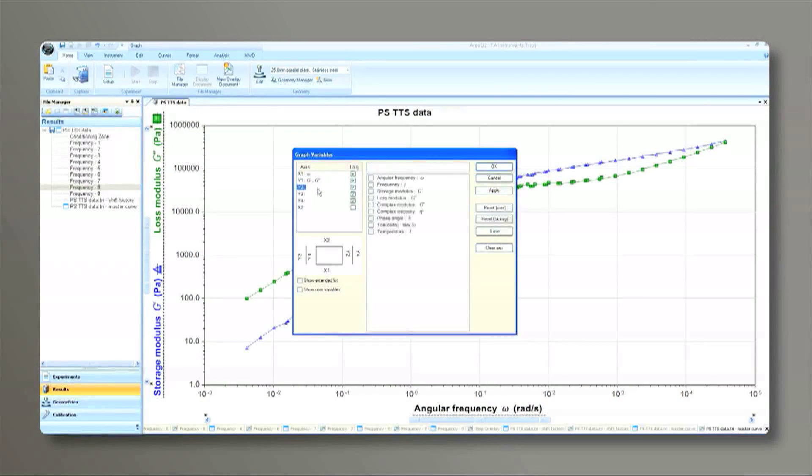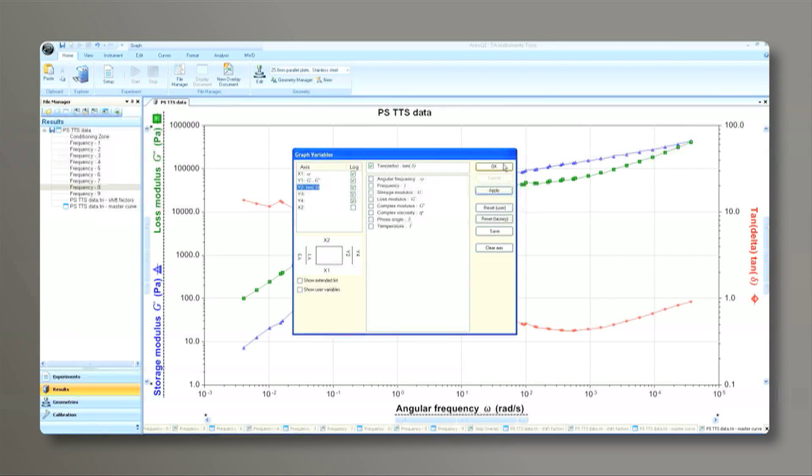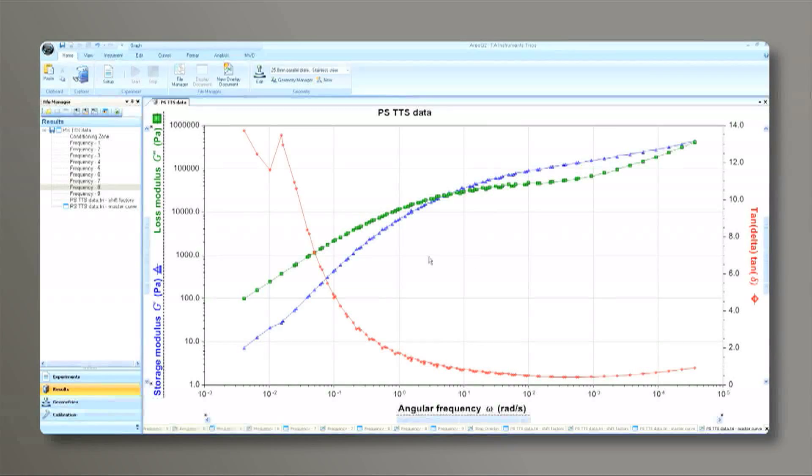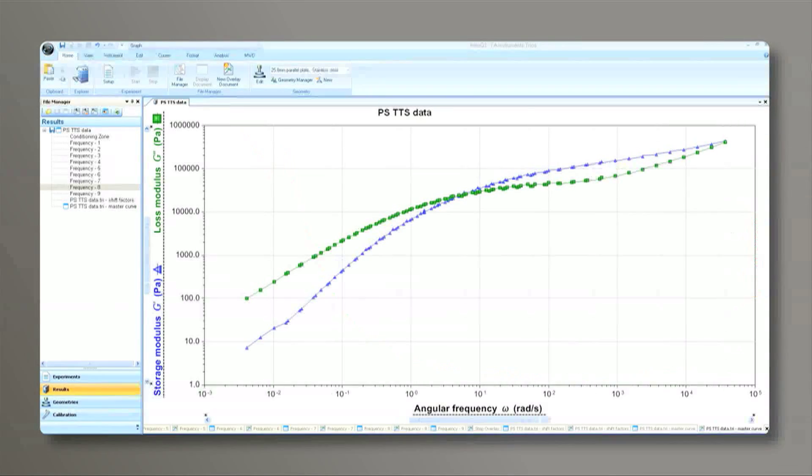Typical tests for this configuration are strain sweeps to determine the linear viscoelastic region, time sweeps to measure stability or time to cure, and temperature ramps or sweeps to determine thermal transitions, measure modulus, and collect TTS data for master curve generation.